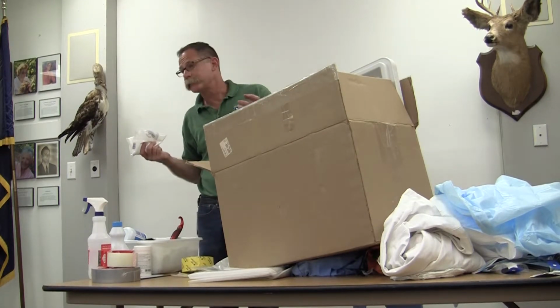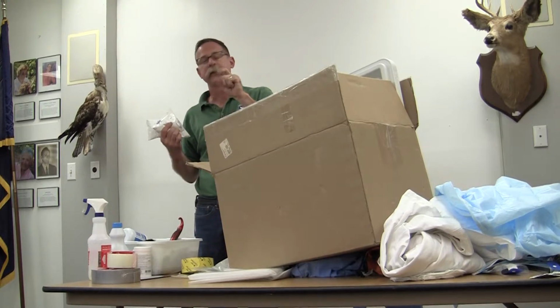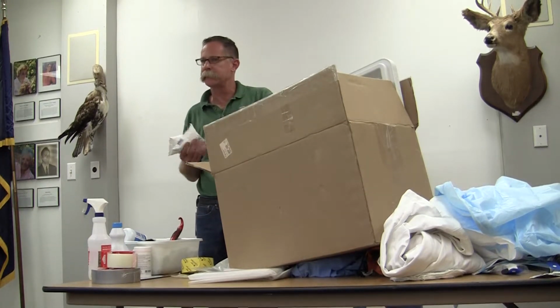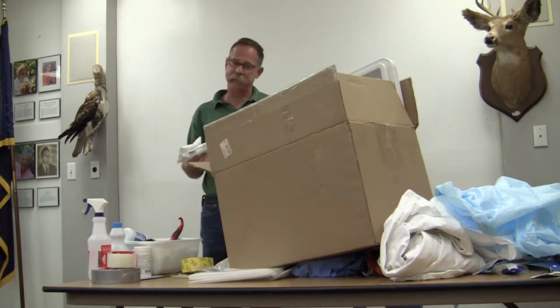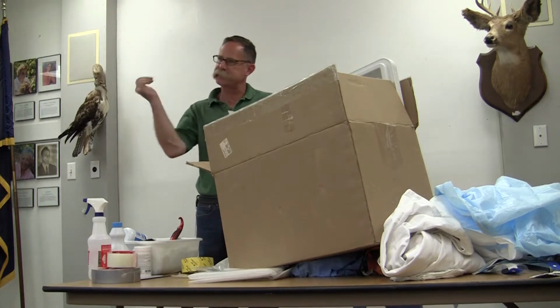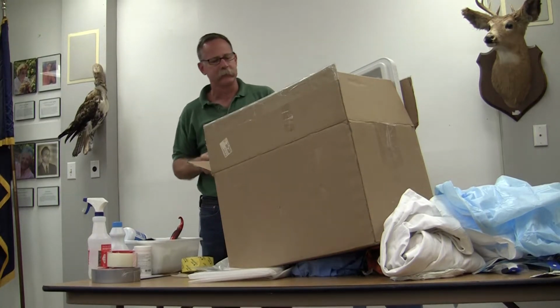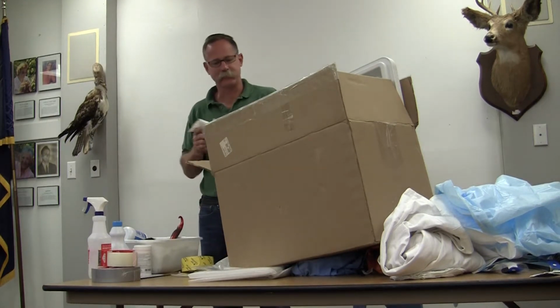One time somebody from New York City took a little passerine bird, I forget what species it was, but it was small. And they just put it in a legal envelope like you'd mail a bill in, and they put it in the mail. And then it came by U.S. mail. It was in the mailbox, and it was this big brown stain. And I think it went through one of those sorting machines and got all squished. So you want to be smarter than that person. It shouldn't be too hard.